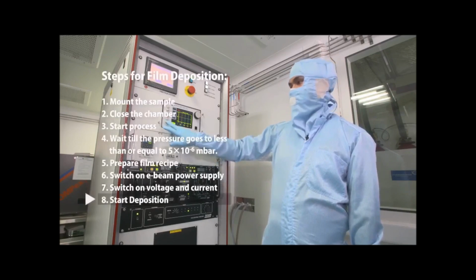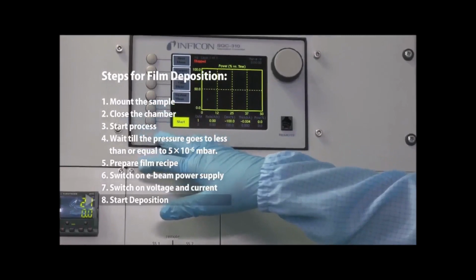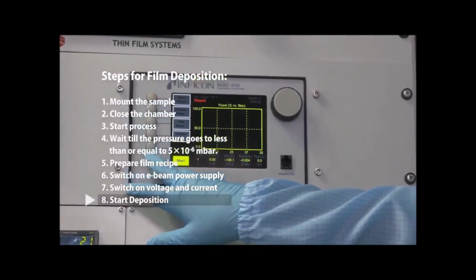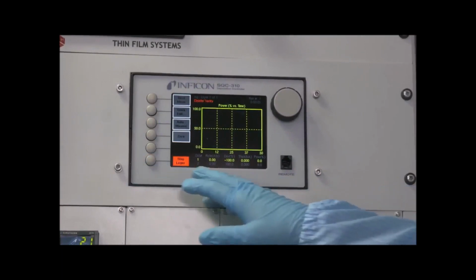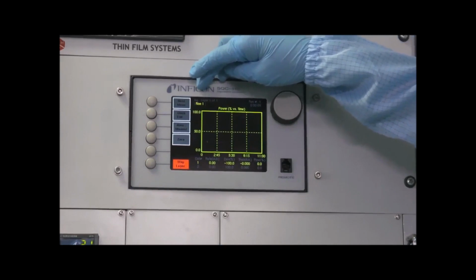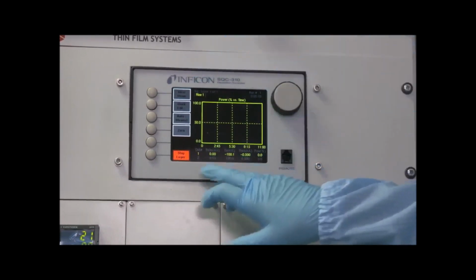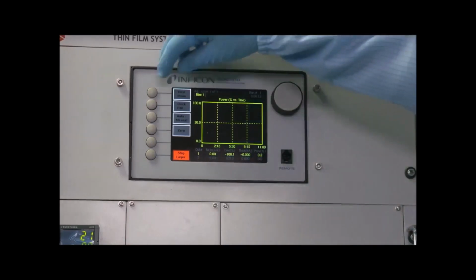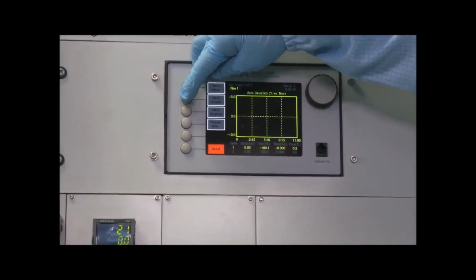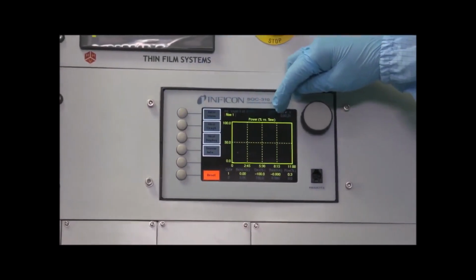We have switched on the E-beam gun, so we can start our deposition process. We have to press start here because we have already put the film menu and process menu. So let's start the deposition process. As you see, we have put the thin film menu of silver. First, it is increasing the power. I will show the power here. We can see the next graph. This is showing the power versus time.